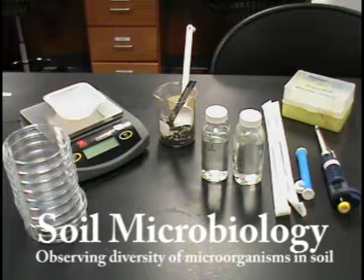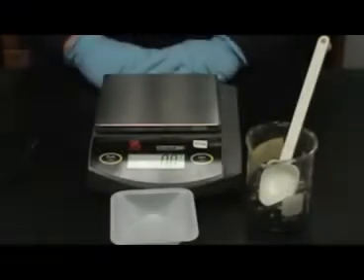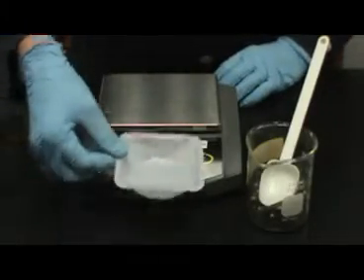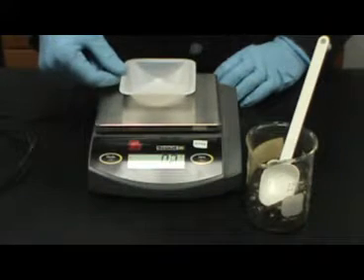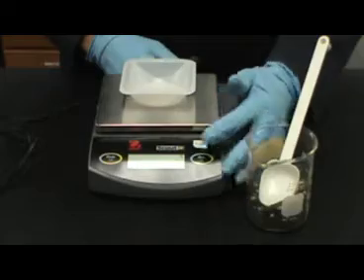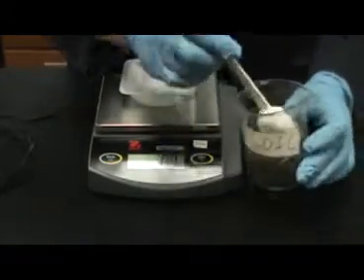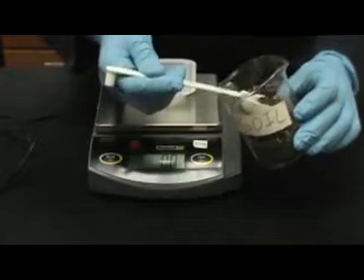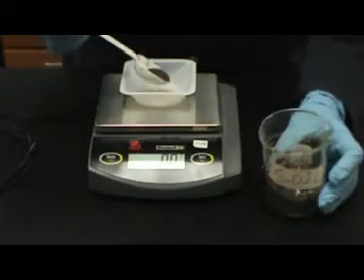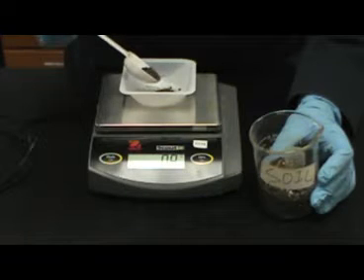Soil microbiology, the observation of diversity of microorganisms in soil. To begin this experiment, you will need to measure 1 gram of soil. Place your weigh boat on the scale and tare the scale. Now, measure out 1 gram of soil. The 1 gram of soil will be the equivalent to 1 milliliter of a liquid sample.